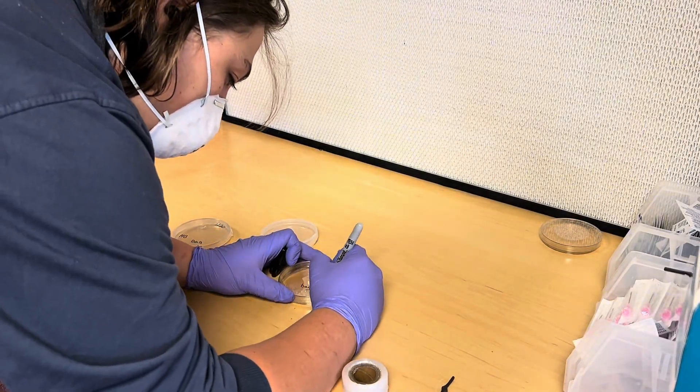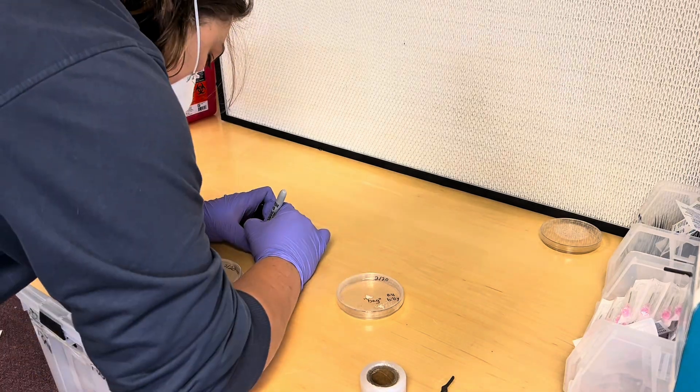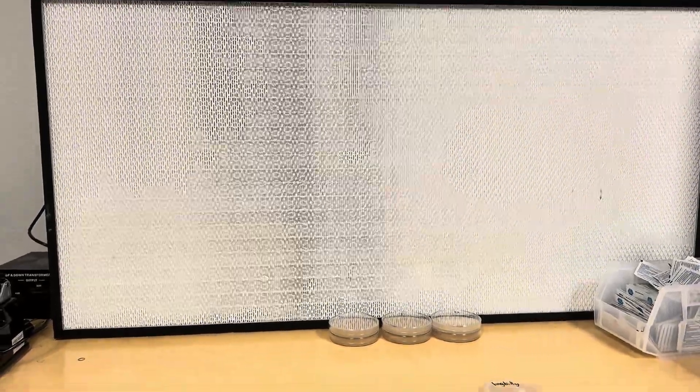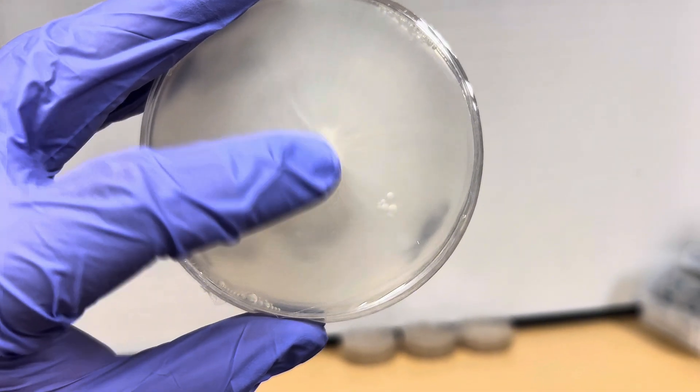After wrapping, you immediately want to label your plates. Labeling is one of the most important parts of mycology — there are so many mislabeled things in mycology right now, and so many strains get mislabeled. Make sure you label everything clearly.